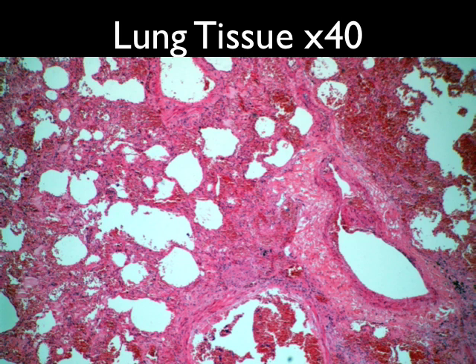It's big. Yeah, the actual sizes of the cells, which you can see around here. You can follow your way around the cells here. This would be the cell membrane. And these blue dots, which I talked to you about before, would be the nucleus of the cell. They're not always in the middle of the cell, like they're drawn off and right at the side, they're anywhere. Okay, so because they're so much larger, I'd say this would be at least times 100, this magnification, despite me writing times 40. Why do some cells not have that blue nucleus, do you think?